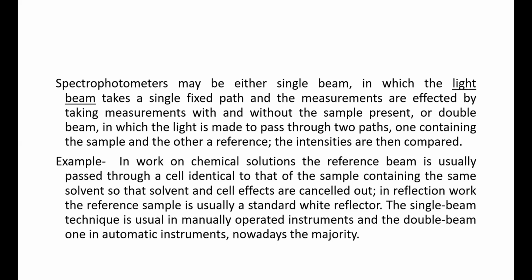But can you imagine if the cuvette having distilled water, which is to adjust the zero, and your sample are both kept simultaneously? So you have an arrangement which will be comparing the absorbance by distilled water against the absorbance by the sample, and you get the output in terms of light transmitted. That will be a different situation, right?